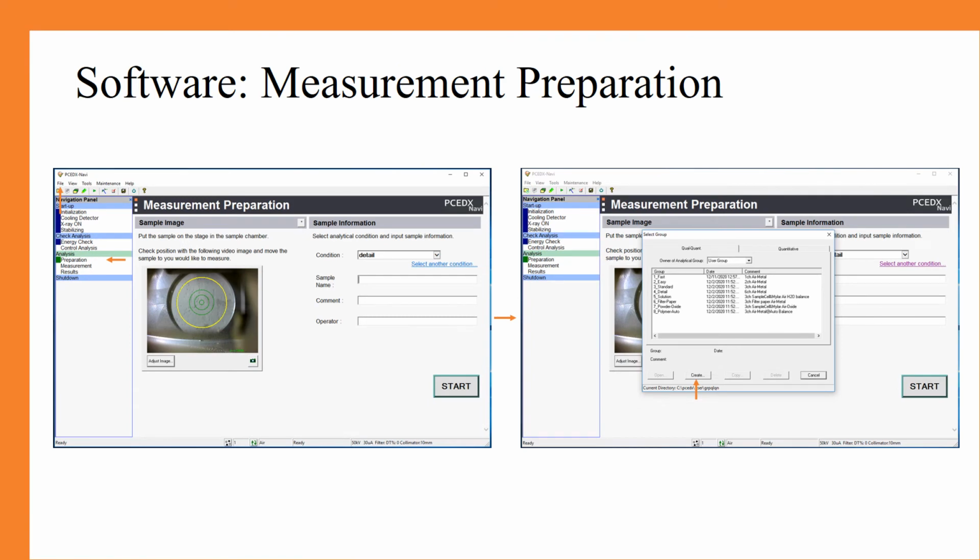After clicking on Usual Analysis, the following monitor to the left should appear. From here, you can see that the check analysis is completed and in blue, and now we are on to the preparation for our run. You are going to click File and you are going to click New Group. From here, you can pick whether or not you would like to use quantitative or qual-quant, and then click Create.